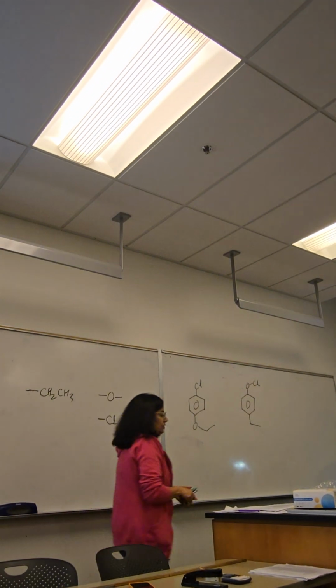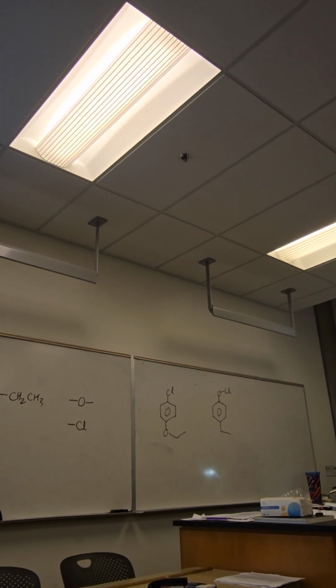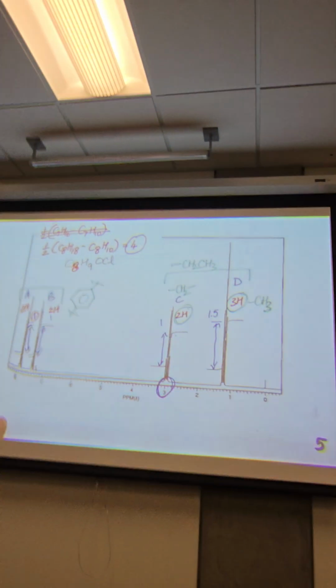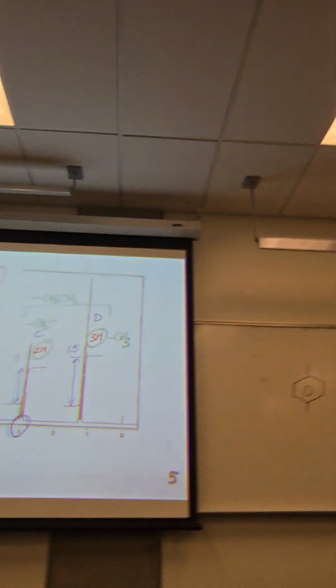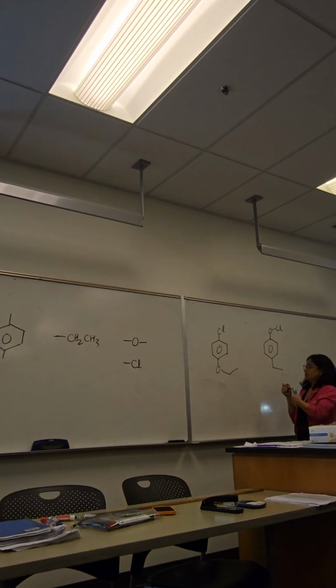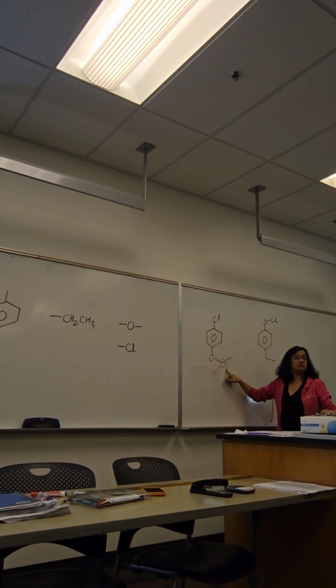So the reason why I'm doubting my chemical formula, to be honest, is because of this chemical shift. It's 3. Where would I expect that signal to show? It's not an alkyne.